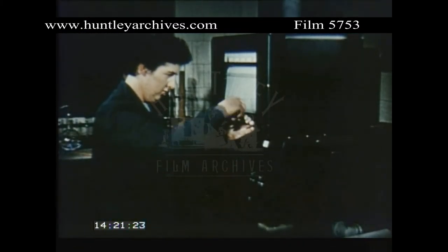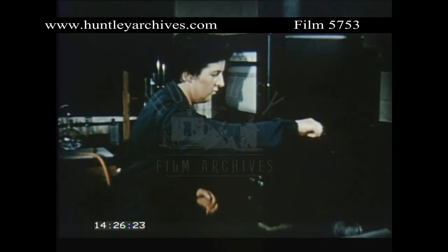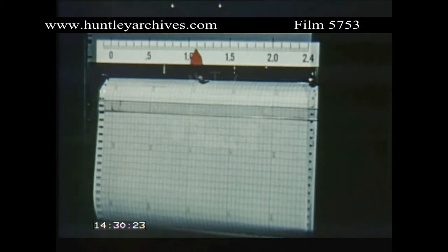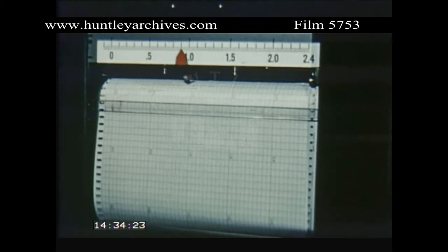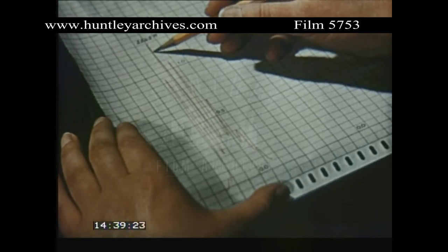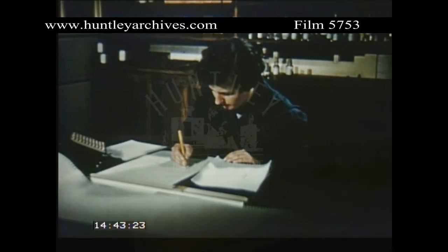The problem here is to determine whether any benzene is present, and if so, how much. A continuous recording spectrograph scans the wavelengths automatically, and the absorption spectrum is drawn by a moving pen. The characteristic trace indicates the presence of benzene, and the amount is calculated from the height of the peak.